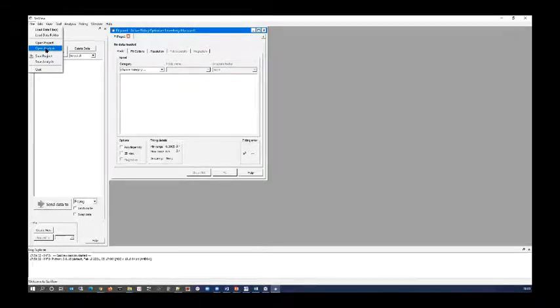The difference between those is that if I've just done, let's say, a complicated fit to a particular data set, I can actually save the current state of SasView with the data and all the parameters and everything like that. I can save that to an analysis. If I have several fit pages I've created, then I can save that as a project. That's the essential difference between them. And the other way of getting data in, of course, is you can just click the big load data button there. But let me demonstrate load a data folder.